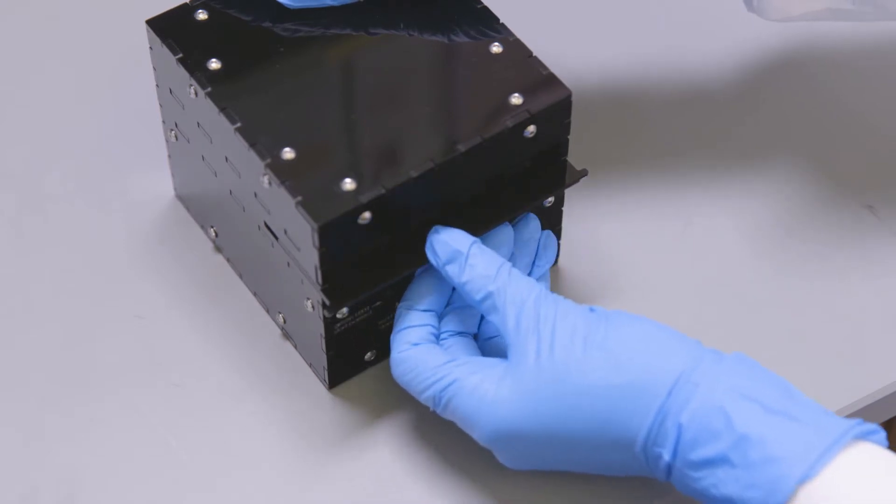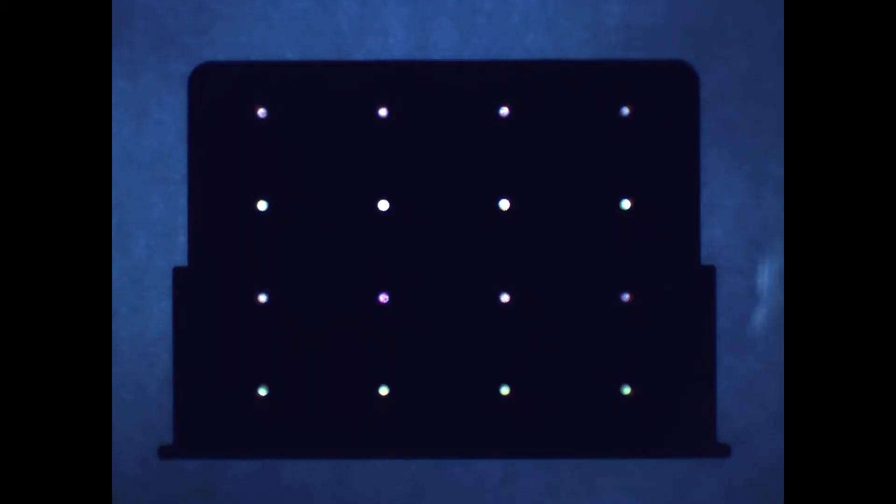The reader works by sensing light passing through the paper discs as they change color from yellow to purple.